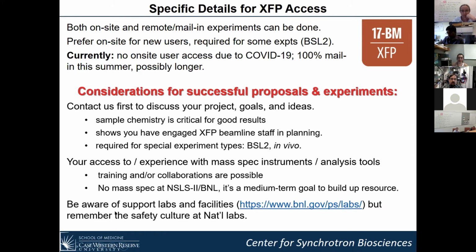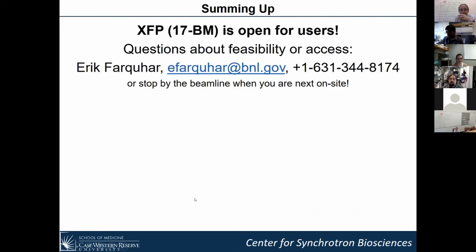And lastly, and I throw this out here every time, be aware of the support labs and the facilities that we have. There's a lot here, but also be aware of the safety culture at national labs. Some things get a lot of scrutiny, and you may not get away with things here that you get away with at other places. In closing, the beamline is open to users. I'm happy to chat about feasibility, access, projects. If you're in a position when the facility reopens to visit NSLS2, by all means, stop by XFP and say hello.